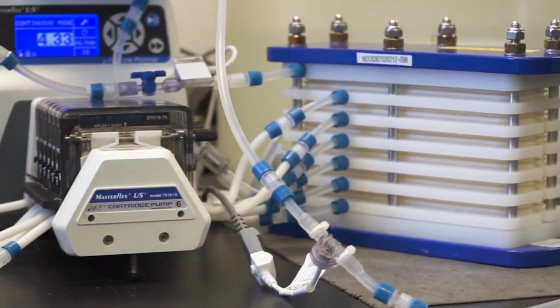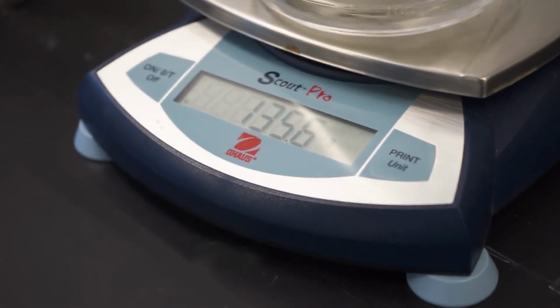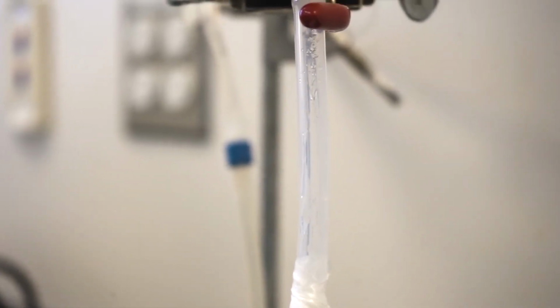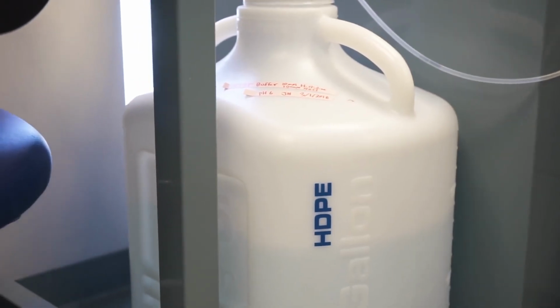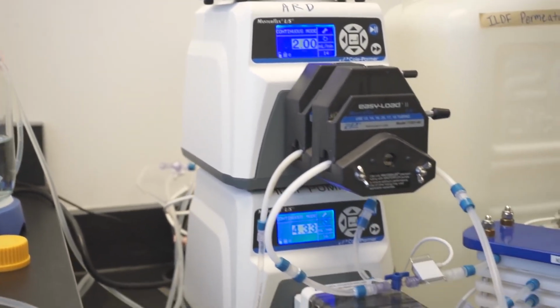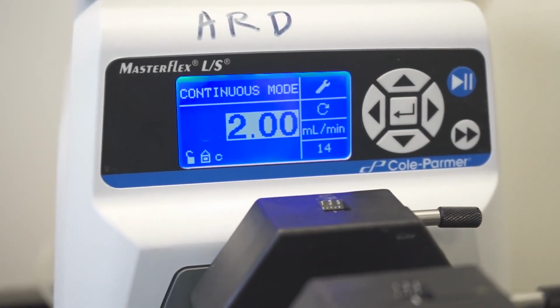Traditionally, diafiltration is performed using tangential flow filtration, or TFF technology. With TFF, a feed pump is used to deliver the process fluid from a feed tank to the filtration device, which is then recirculated back to the feed tank. As the process fluid is being continuously recirculated through the system, fresh buffer is being added to the feed tank to replace the permeate buffer that's being removed. Conventional TFF requires constant recirculation through the system. It makes it somewhat unsuitable for continuous processing. Also, it doesn't operate at a steady state, so the concentration is changing over time throughout the process.